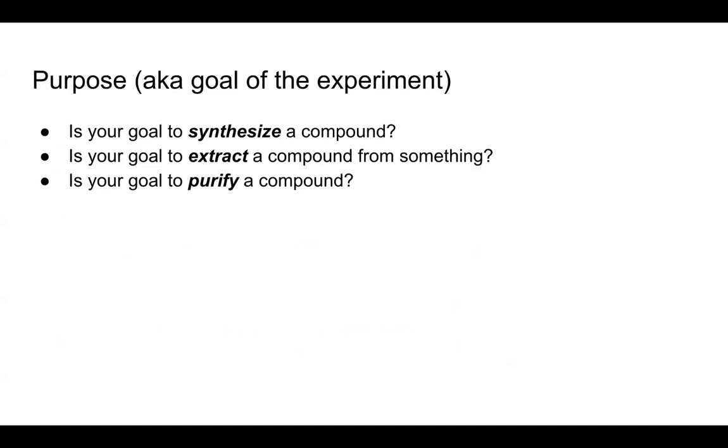So your goal could be to synthesize a compound. Are you making something new from other reagents? Or is your goal to extract a compound from something else? Or is your goal to purify that compound? Now, some of these are a combination of them, and we have terms that help explain that.